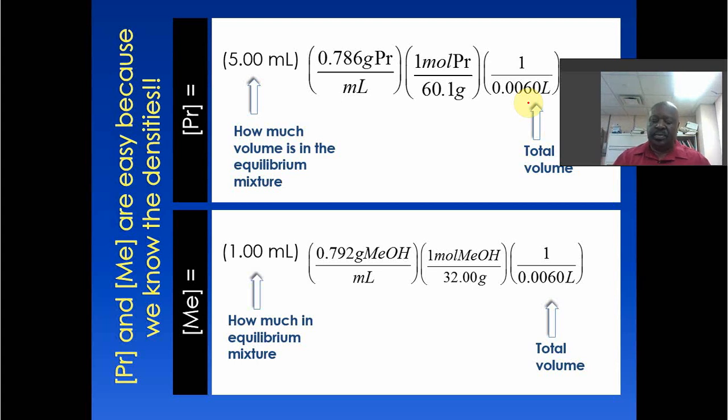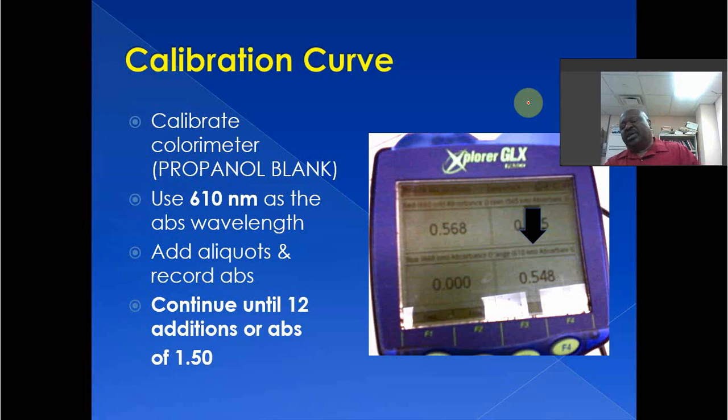How about the other two? We're going to do a calibration curve here, and we're going to monitor the concentration of the blue species. How do we do that? Blue. So it's [CoCl(PR)3]+. We'll tell you this is 0.01 molar [CoCl(PR)3]+. We'll give you that concentration in a PR solvent, in propanol. So blank the instrument with propanol, and then we'll add small aliquots like 0.1 milliliter of the standard.